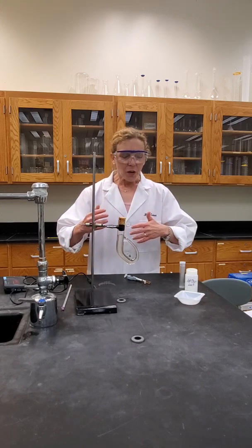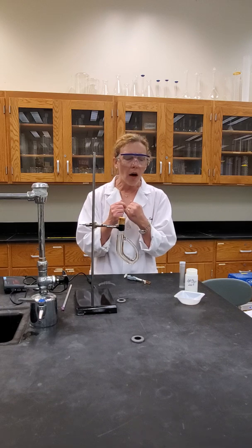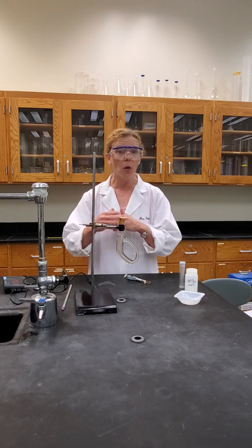What we will do is follow the exact directions that either I've given or your instructor has given you, as far as, are you using a known compound and then determining the identity of an unknown? Are you determining the identity of multiple unknowns? Are you just working with unknown?